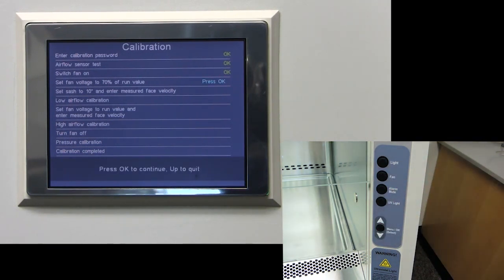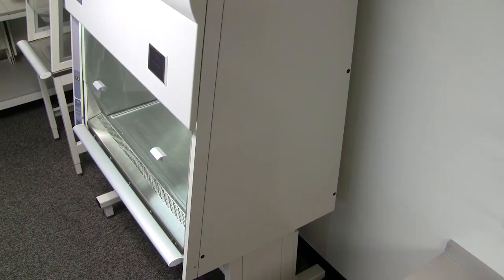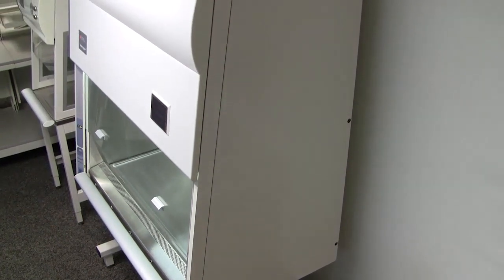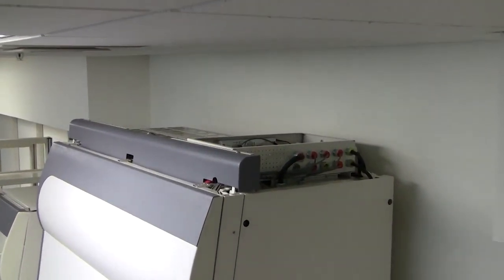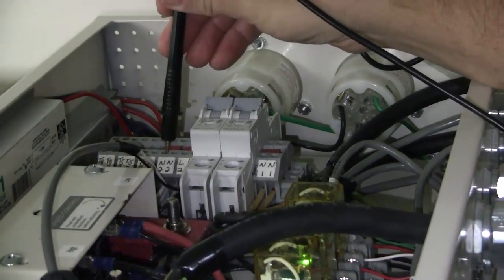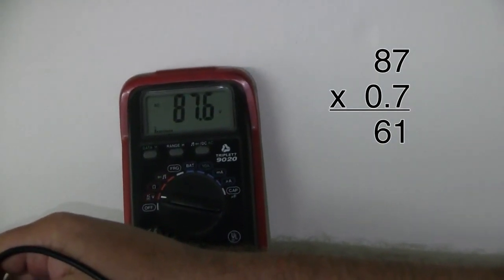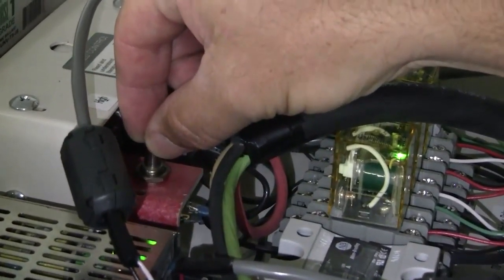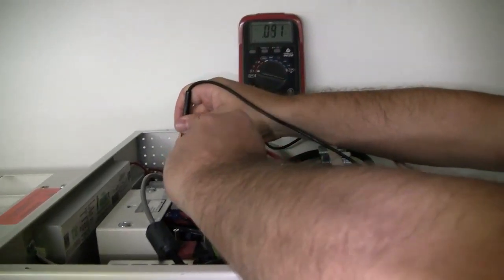The first step is to press the fan button to start the blower. Then you will need to set fan voltage to 70% of run value. To do this, you will need to access the top of the cabinet in the electrical box. In this box, you will use a voltmeter to find the voltage. Place the black probe on the neutral contact and the red probe on the red spade shown in the video. Be sure to keep the probe from touching any other surfaces while in contact with the spade. Once you have your voltage, calculate 70% of that number and adjust the silver high speed potentiometer until you are at the 70% voltage from the previous step.